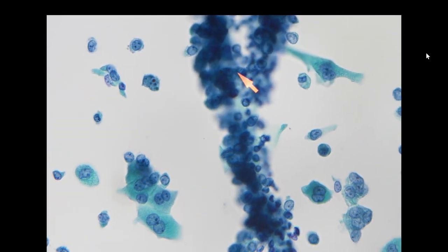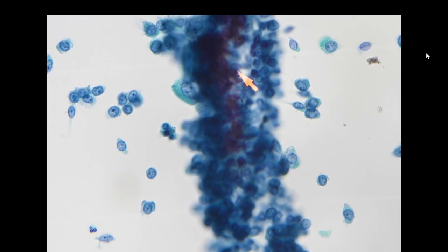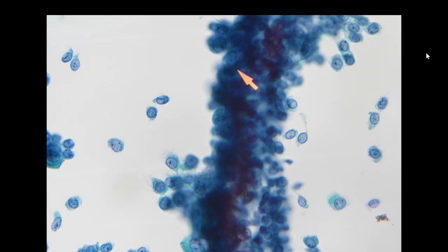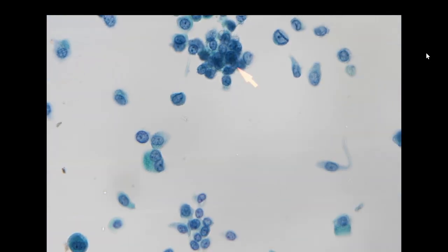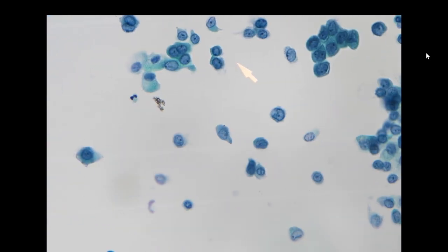So this is a very classic cytology example of a low-grade urothelial neoplasm. When we have a specimen like this, it is highly suggestive that it's a low-grade urothelial neoplasm.